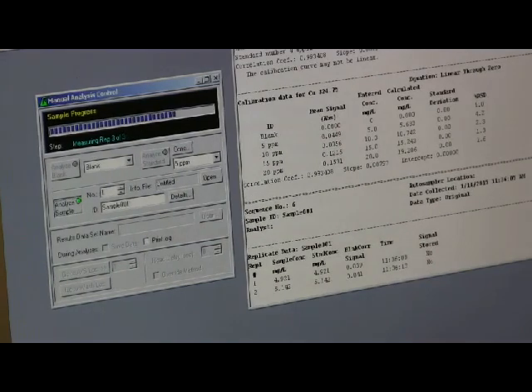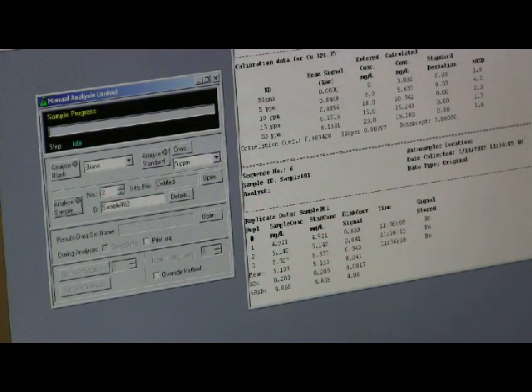It calculates this based on your correlation coefficient and the slope. Not the correlation coefficient, sorry, the slope. But I would not use their value of slope because, as I said, I prefer y equals mx plus c. And it's better if they get their own plot and then calculate it from their plot.